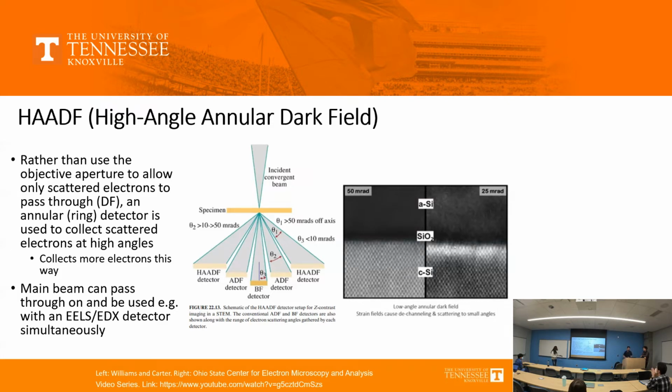And then there's also annular dark field, as distinguished from high angle annular dark field, that is from 10 to 50 milliradians. We'll start with high angle annular dark field and then work back. With high angle annular dark field, as electrons are traversing your sample, you have Rutherford scattering of those electrons, which means you have a heavily Coulombic scattering event that can deflect electrons to very high angles. And the severity of that scattering cross-section scales almost according to Z squared, being a Coulombic interaction.